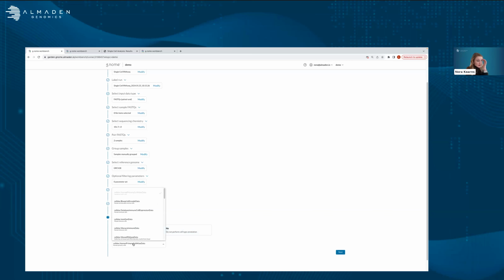The reference data sets that we have available, there are 28 of them hosted by the CellDex library and the scRNA-seq library. CellDex hosts 7 well-validated data sets that are generally compiled from individual bulk RNA-seq data sets. So they took a single cell type, ran bulk RNA-seq analysis on those cell types to establish an expression profile, and then compiled them. So these are really strong reference data sets, but they are a bit skewed towards immune data. So they're great if you're working with PBMCs, for example.